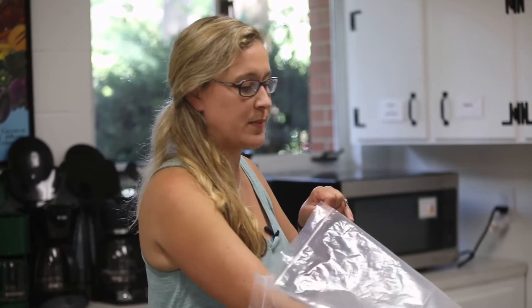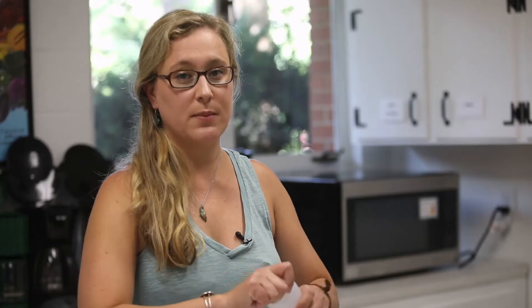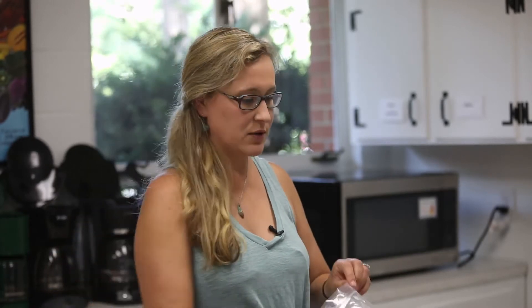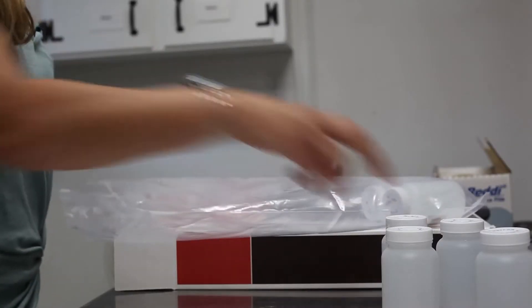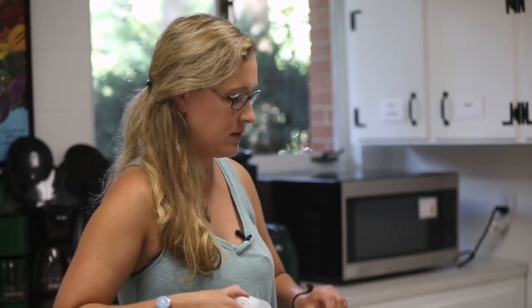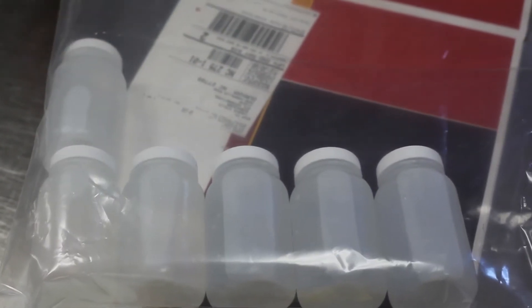Here we have six bottles that we just filled and we're going to place them into the large bag. You can give it another check and place it in the bag. Up to five bottles fit in a row in the bag and then you can stack another bottle on top. Up to sixteen bottles fit in these bags.